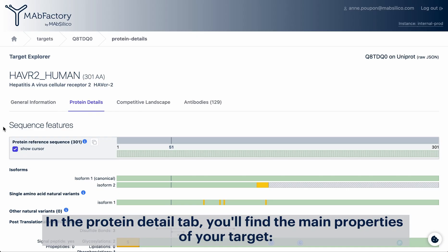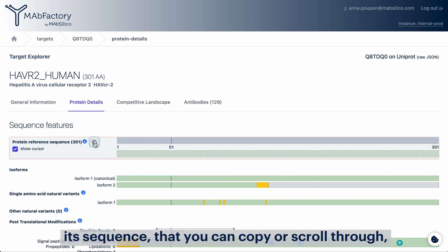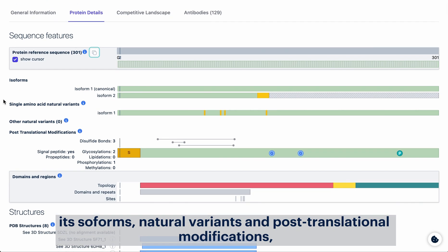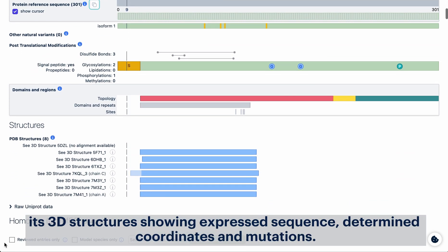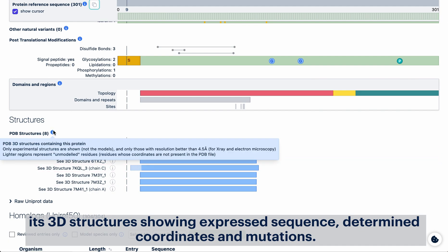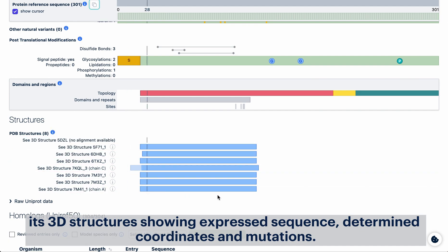In the protein detail tab you'll find the main properties of your target: its sequence that you can copy or scroll through, its isoforms, natural variants and post-translational modifications, and its 3D structures showing expressed sequence, determined coordinates, and mutations.